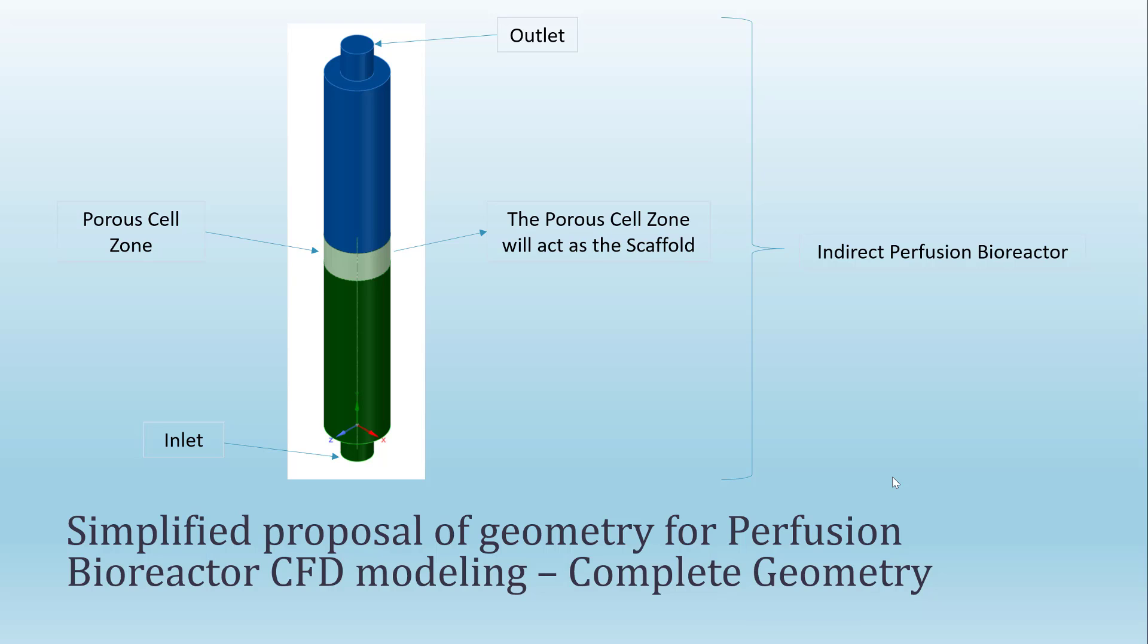To accomplish the goal of this video, I am going to explain how to set up the model for an indirect perfusion bioreactor. The simplified geometry of this reactor is shown right now. You can see that we have here the geometry of the perfusion bioreactor. We have the inlet, the fluid inlet, we have the fluid outlet, and here we have this region that will be modeled as a porous cell zone.